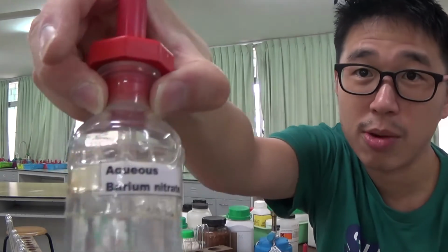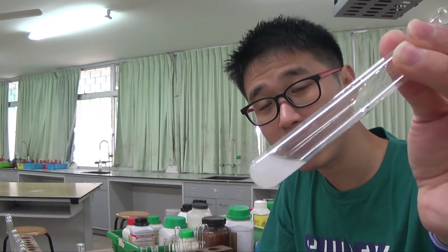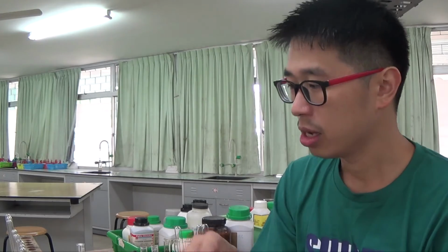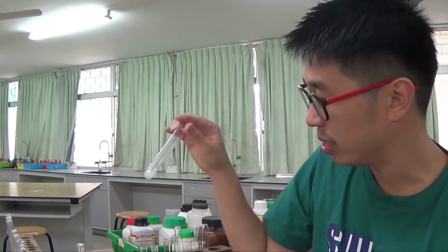It's a white precipitate when I add barium nitrate or when I add barium chloride, so BaCl2 aqueous, which is colorless, or barium nitrate, which is colorless, because all nitrate salts are soluble in water, and I get a white precipitate. This tells me that sulfate is present. SO4 2- is present. So there's my anion. SO4 2- is present.